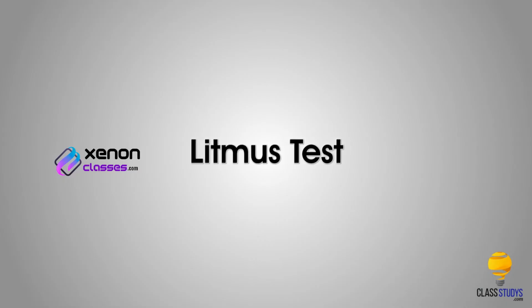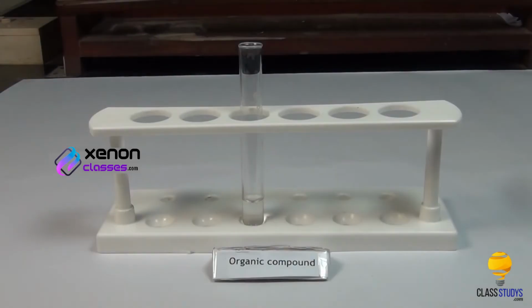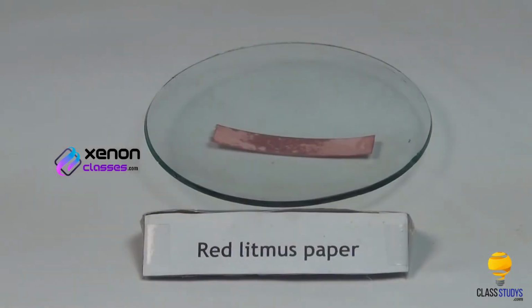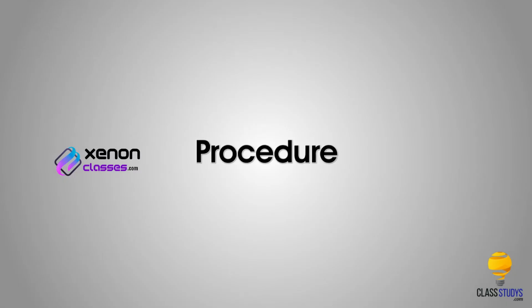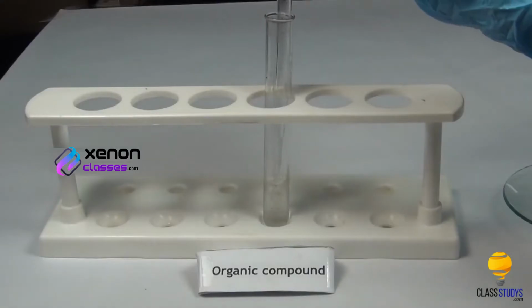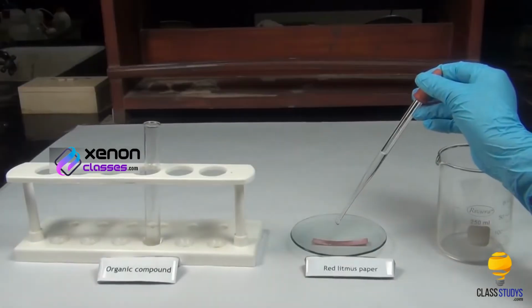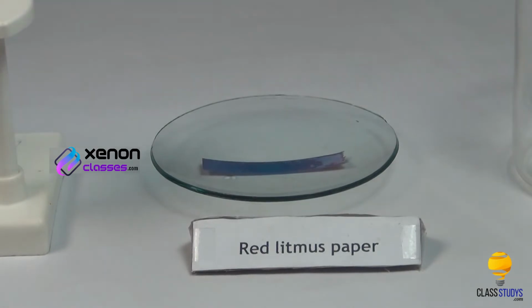Litmus test. Materials required: organic compound, moist red litmus paper and dropper. Procedure: take a small quantity of organic compound using a dropper. Put 1 or 2 drops of the compound onto the moist red litmus paper. Amines turn red litmus blue, indicating it is basic in nature.